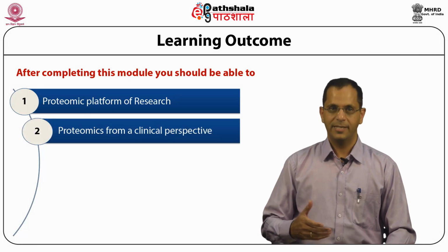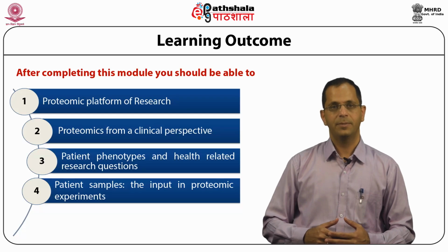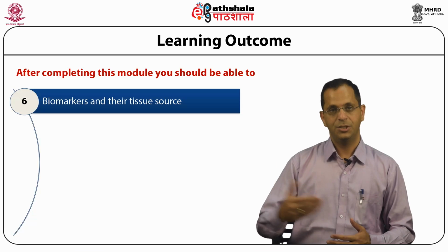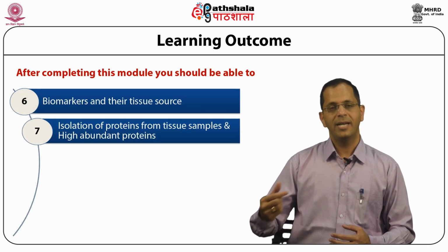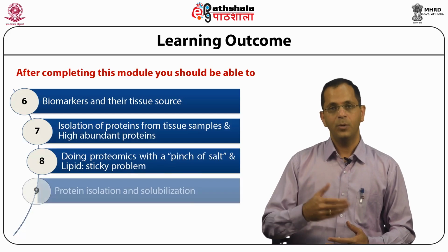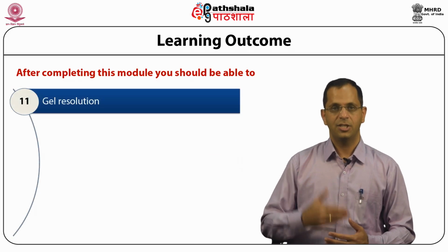Proteomics from a clinical perspective, patient phenotypes and health-related research questions, aspects pertaining to patient samples, the input in proteomic experiments, the necessity of homogeneity of samples, biomarkers and their tissue source, isolation of proteins from tissue samples, the important aspect of high abundant proteins in proteomics, how salt affects the resolution of gels, protein isolation and solubilization, and dealing with hydrophobic proteins that you may come across at the time of protein isolation and gel resolution.